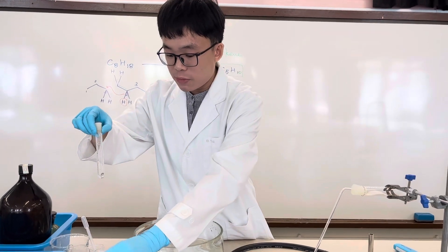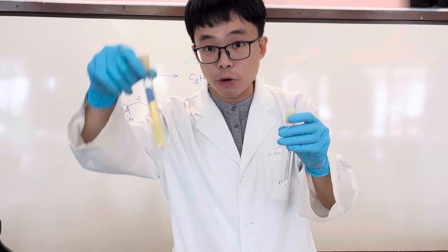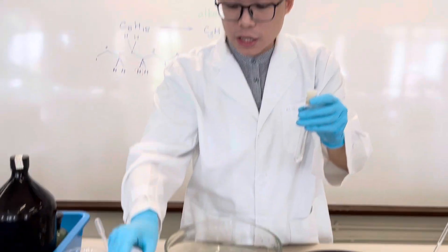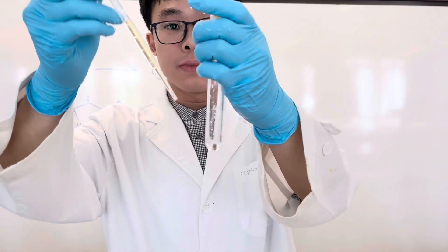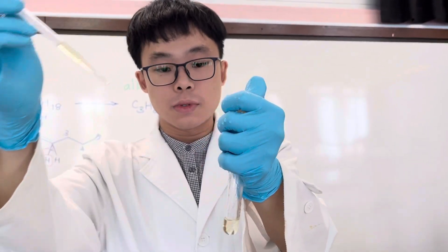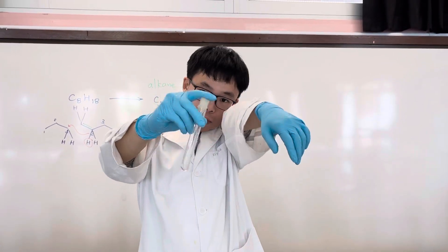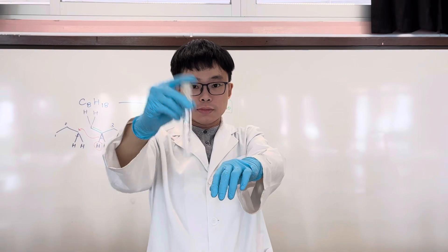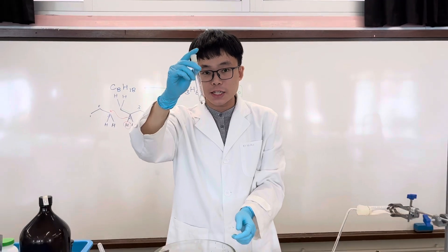We also test with bromine solution — here is our collected gaseous product and here is the bromine. Bromine was yellow in colour because it is so diluted. After adding and shaking, it has been decolorized completely. Both test tubes have been decolorized, whether with bromine solution or acidified potassium permanganate solution.